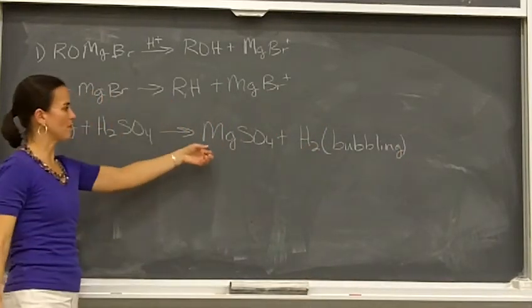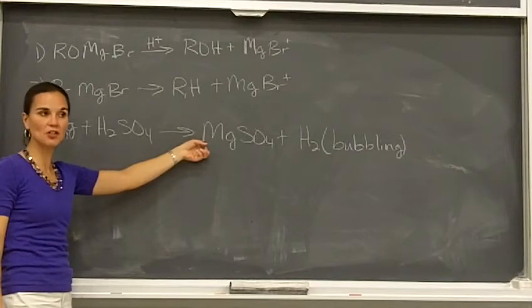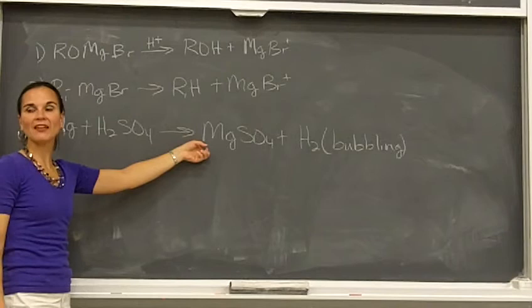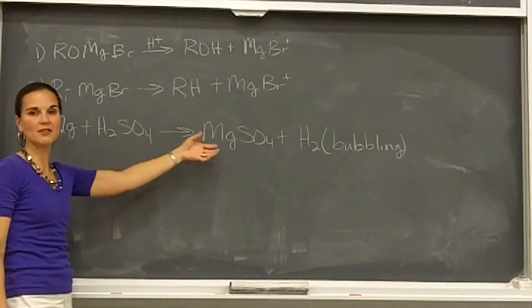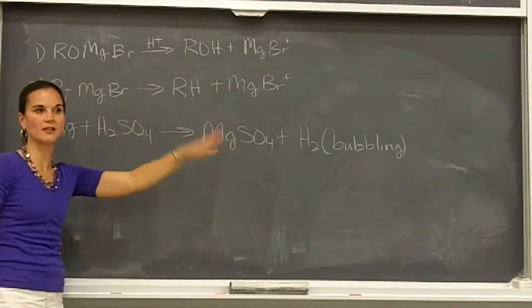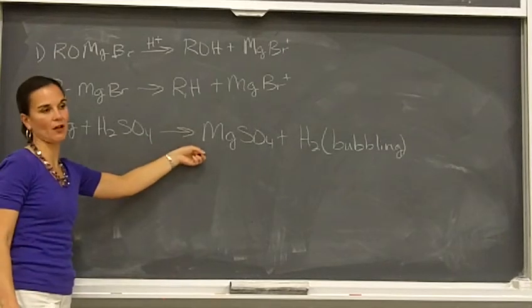This magnesium sulfate is a white solid, and so what you may start seeing is accumulation of the white solid. Don't worry about it until you're at the end of all your sulfuric acid addition, okay? Because sometimes you accumulate the white solid, and then eventually once you've added all the sulfuric acid, it goes back into solution again, okay? But you may see this white solid.